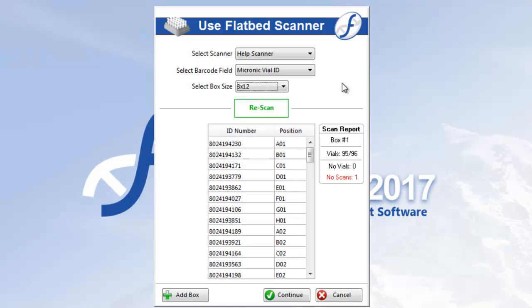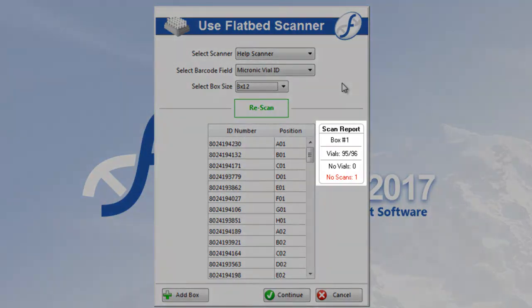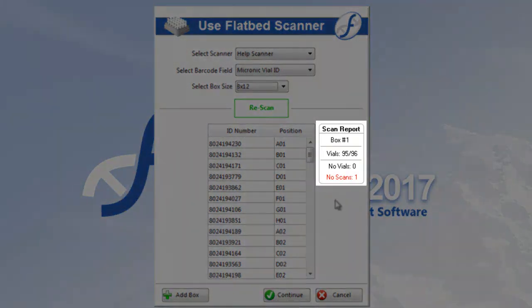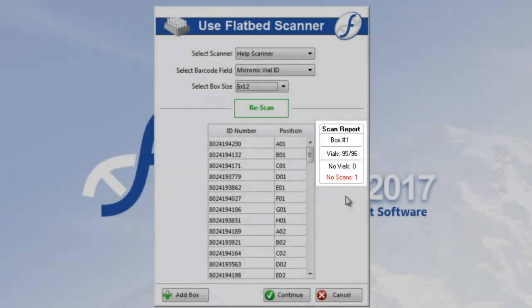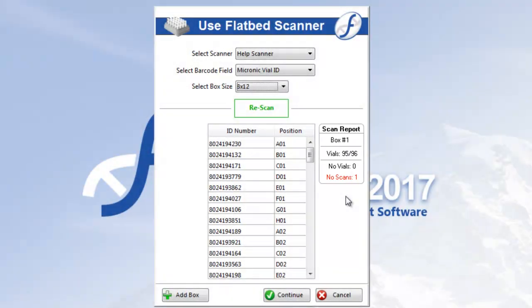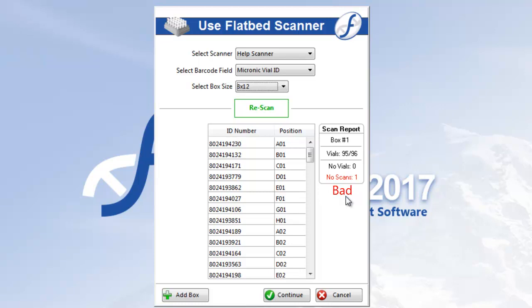Once the scan completes, the list of values will appear below. Next to the list of values is the Scan Report, where you can see the number of vials scanned, including any no vials and no scans. Now, no vials means that there is actually nothing to read in that box position, and no scan means there is something in the position but for whatever reason it cannot be read.